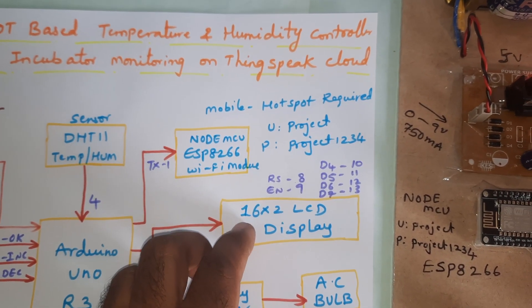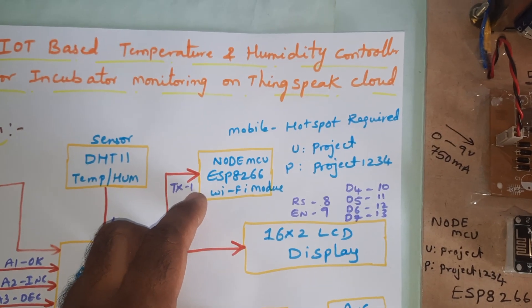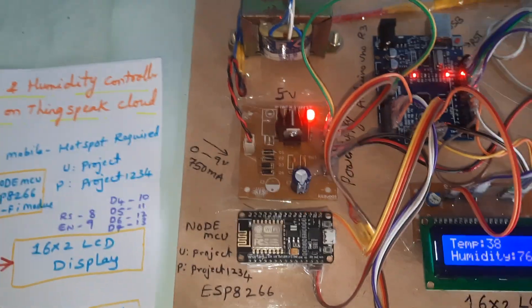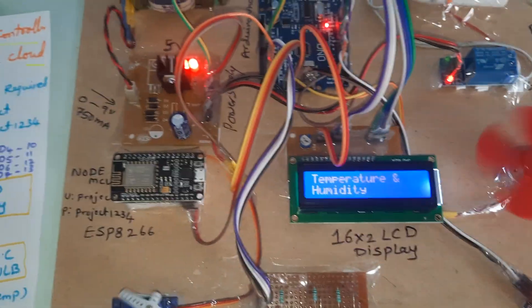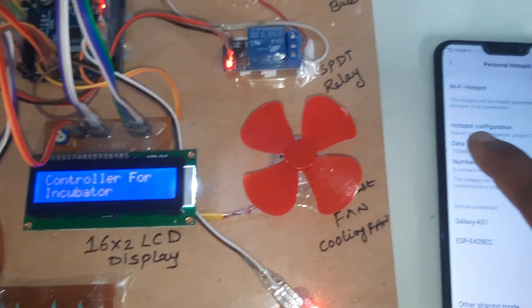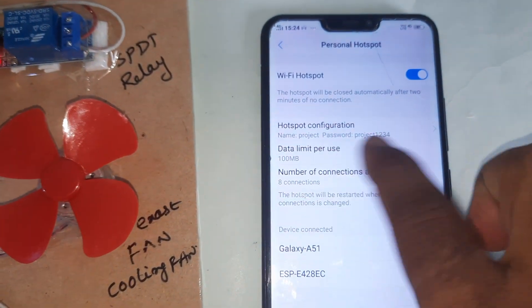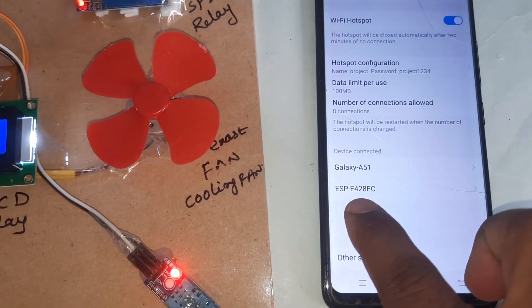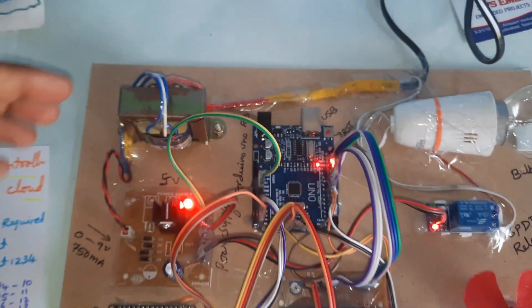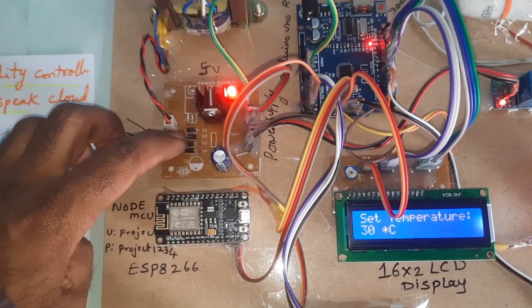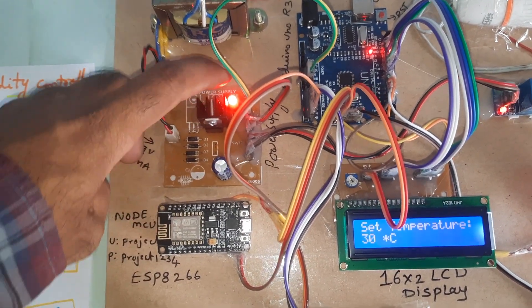Pins 8 through 13 are used. The NodeMCU ESP8266 requires mobile internet. Now connecting the mobile hotspot — network: project 1234. The ESP8266 is connected. The power supply uses a 230V input, step-down transformer giving 9V output, through a bridge rectifier, filter capacitor, and 7805 voltage regulator.